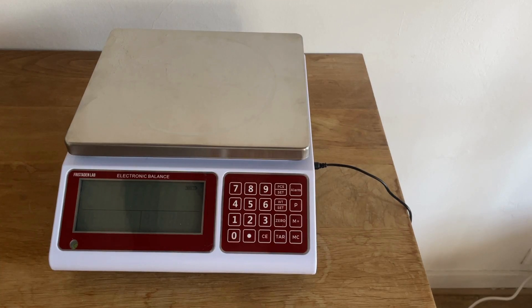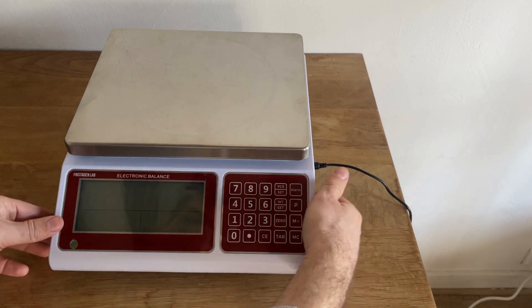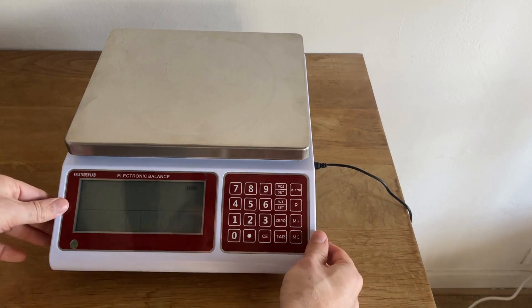This video details the operations for the Frischten Lab counting scale. The counting scale has been taken out of the box and plugged in. It's on a flat, stable surface, and we've already used the adjustable feet to make sure it's level.